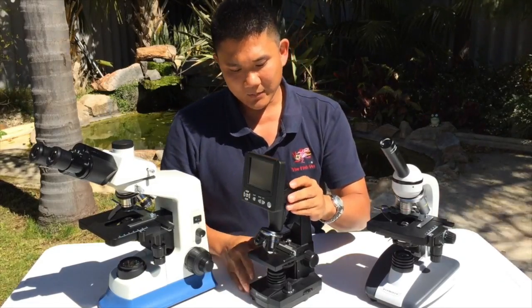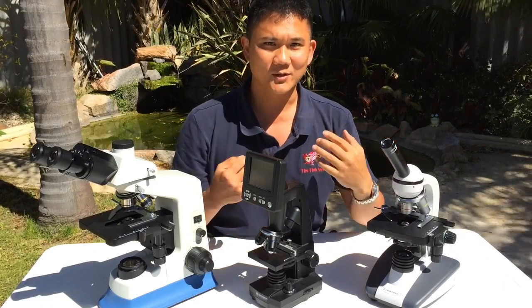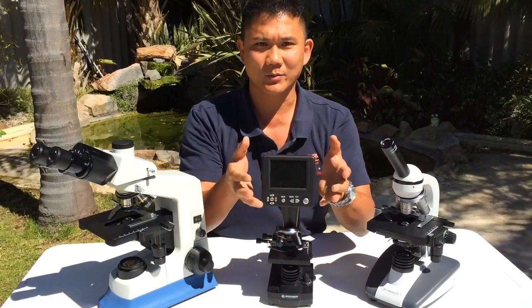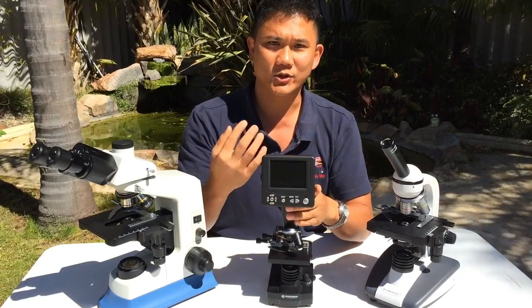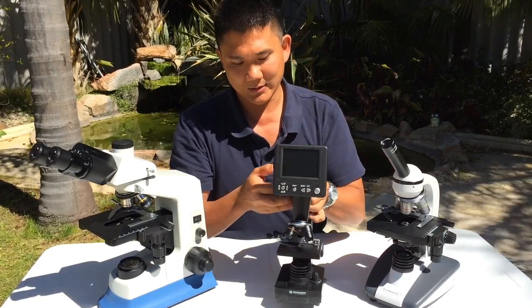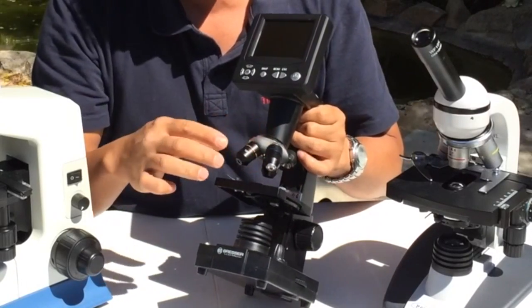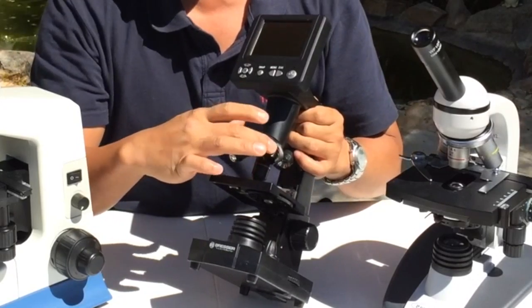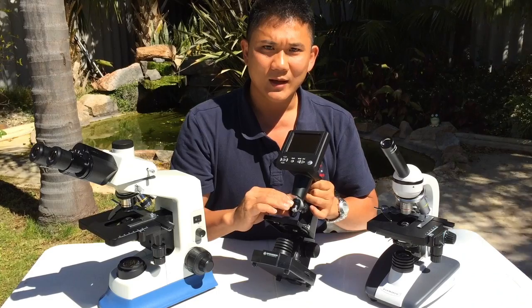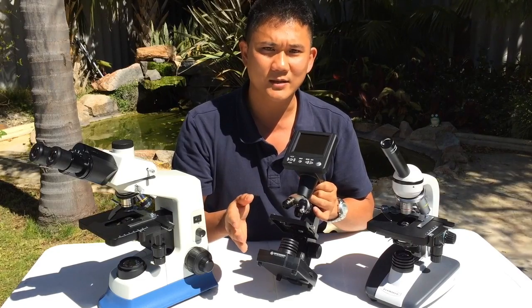Most of us aren't born to look down an eyepiece — most of us grow up watching TV. So a TV-type screen, a computer screen, or a monitor that shows you what's seen in the microscope is very helpful for beginners. This microscope also features three objectives on the nosepiece: 4x, 10x, and 40x magnification. With these you should be able to pick up almost every common disease known to fish.